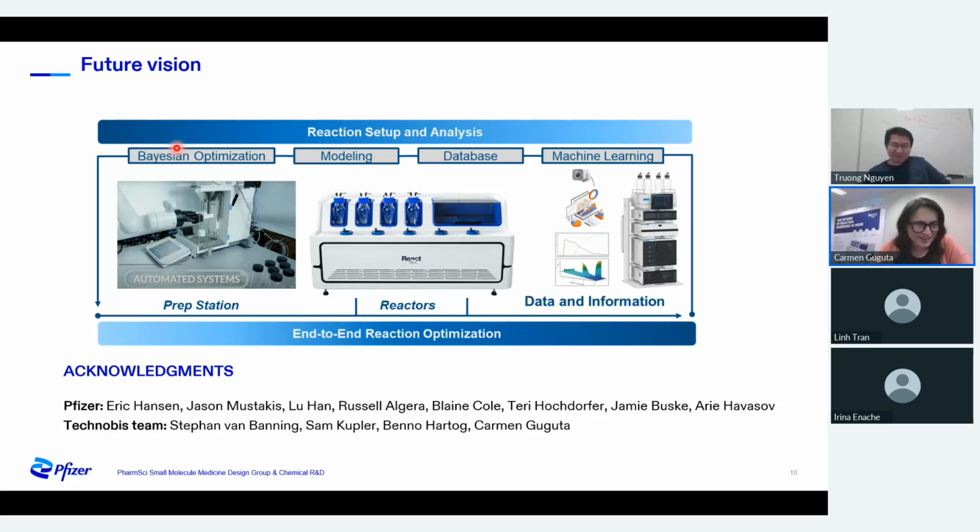Yes. And he also asks if it comes with product or impurity mass detection. No, the reactor does not. But I think there are other methods for how to do that, right? Offline.